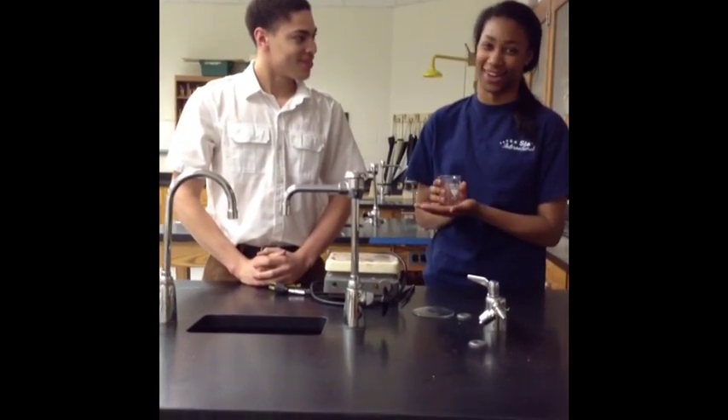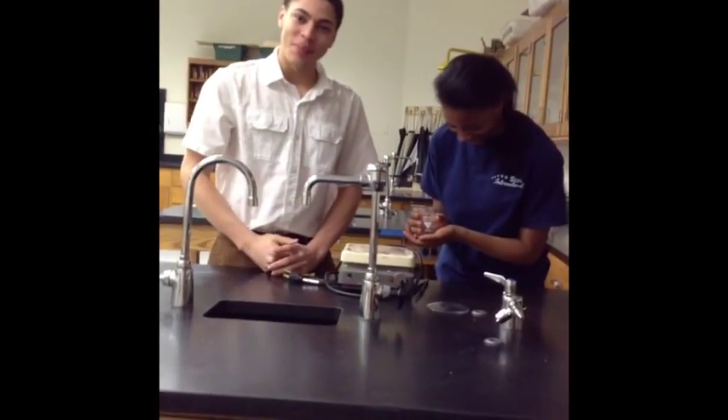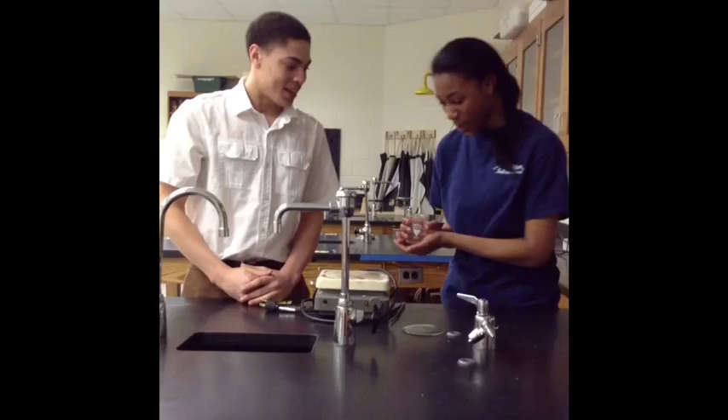Next, we have the beaker. You put different solutions in the beaker — all different types. And you can mix them with something you'll learn about later.